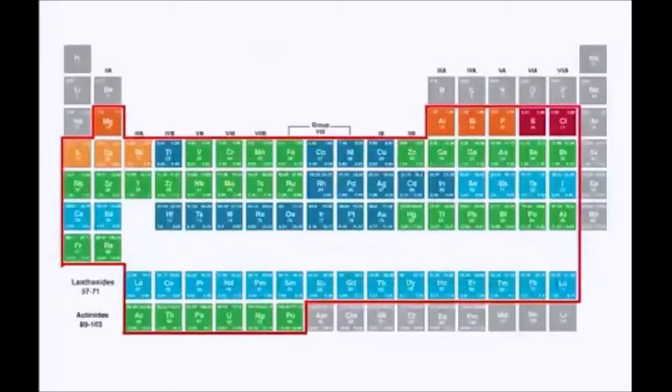The elements that we can test are circled here by the red boundary. Basically from magnesium to plutonium is what we can do. Magnesium is the lightest element that we can test. The things that we can't do that are common to real-world applications in alloy testing would be things like carbon, oxygen, nitrogen, sometimes beryllium or boron. Anything lighter than magnesium, lower Z number in this chart, would not be measurable.